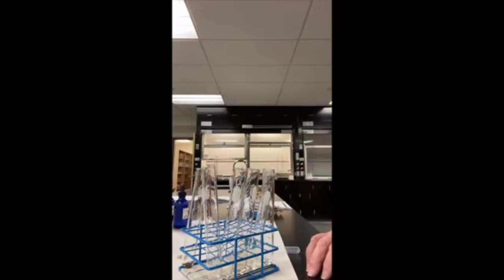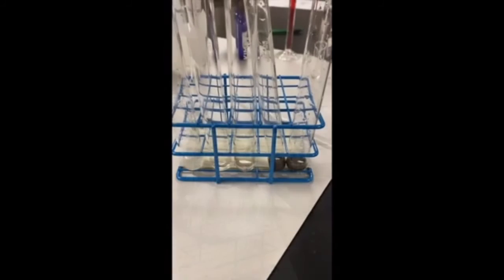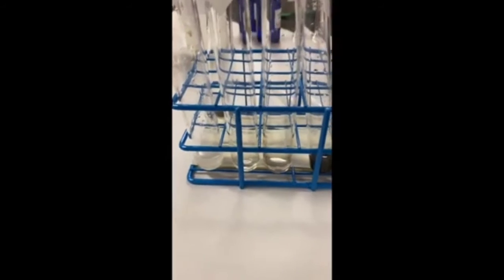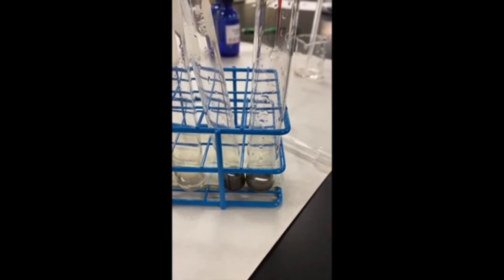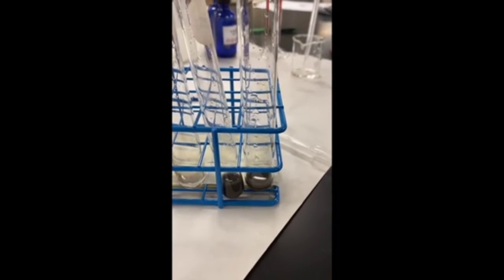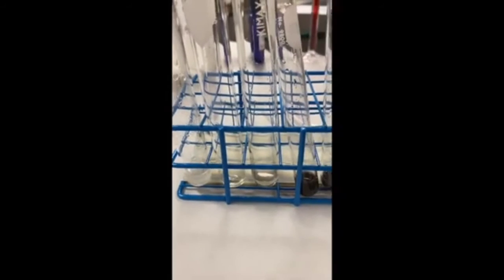I'm going to add acetone, 3-pentanone, formalin, and acetaldehyde, and then they need to rest a bit, and we'll see what happens with our results. So I'm going to let these set for a little bit so they can process. But right off the bat, I saw a big difference on formalin, which is a form of formaldehyde. Immediately when I put in the drops, it turned this dark color, and the same thing with acetaldehyde. These other 3, we're going to see what happens.